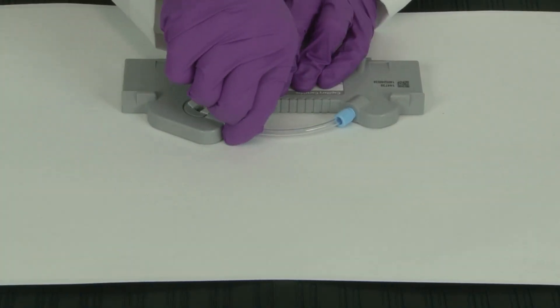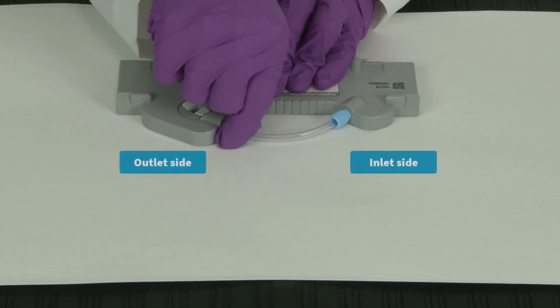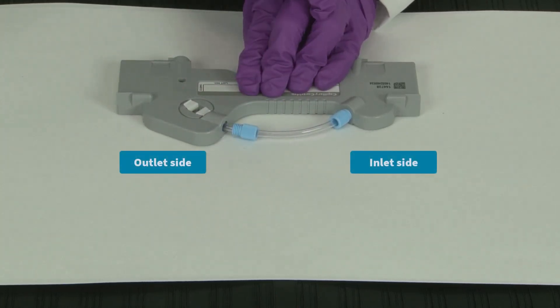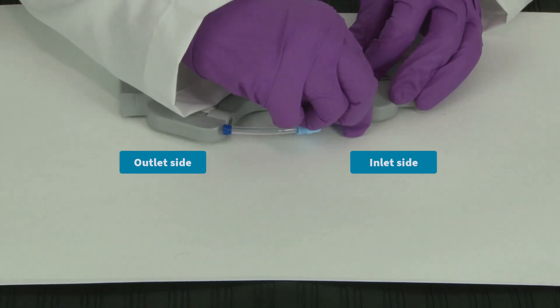First, you'll begin unscrewing the light blue nut closest to the outlet side of the cartridge. Then pull out the tubing. Repeat this step on the other light blue nut closest to the inlet side.